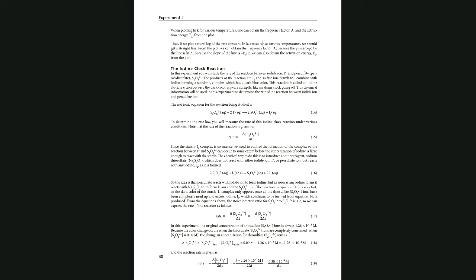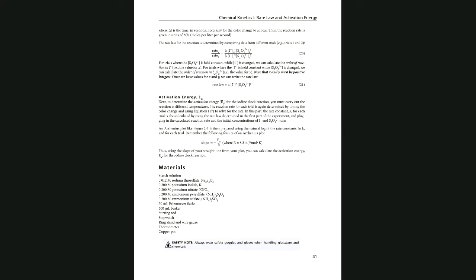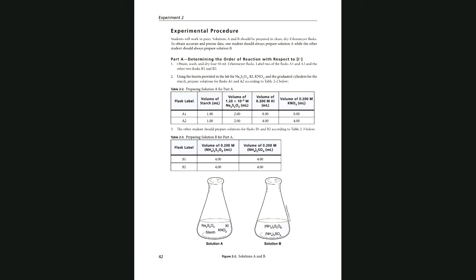So when we do 7 trials of the experiment, basically we are going to find 7 different times for the reactions, and then you move to calculation. The data that is most important for you to record, and you cannot do it without watching the video, is the time for each trial of the experiment. Then when you have the numbers, you can do your calculation. And the last step would be to calculate Ea, which is plotting the graph and finding the slope, and based on that, you would find your slope, the Ea value.